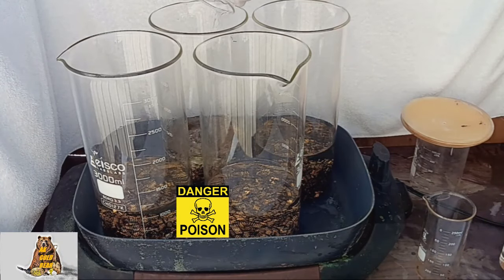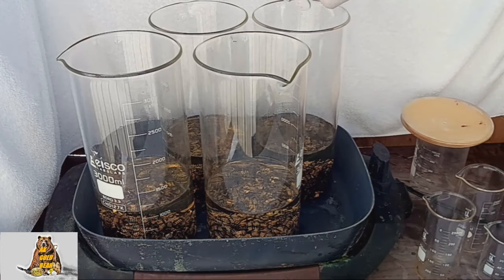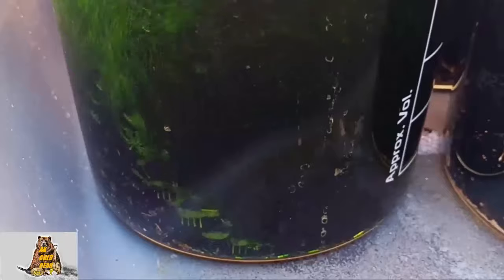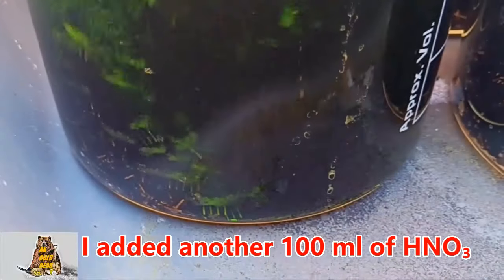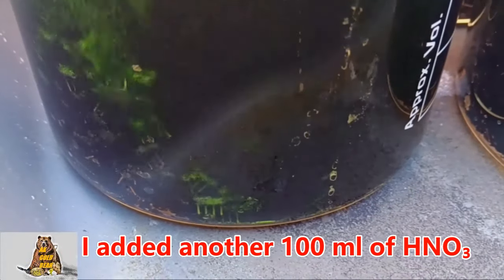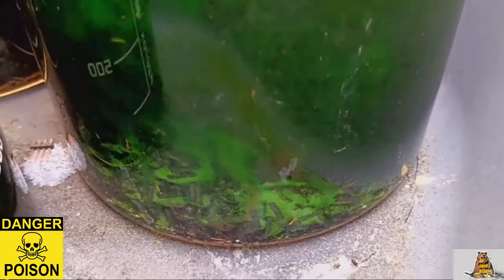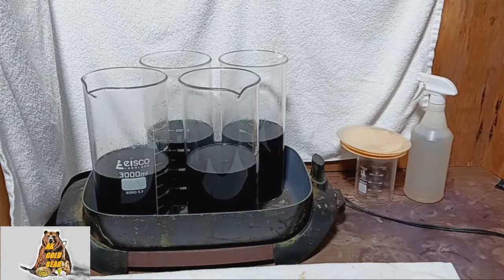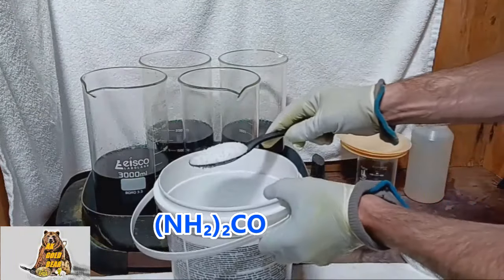Little by little, no need to hurry. The pins are dissolving pretty quickly, and that's good. I added another 100 milliliters of nitric acid. Everything dissolved in 3 hours. Now I need to neutralize the nitric acid with urea.